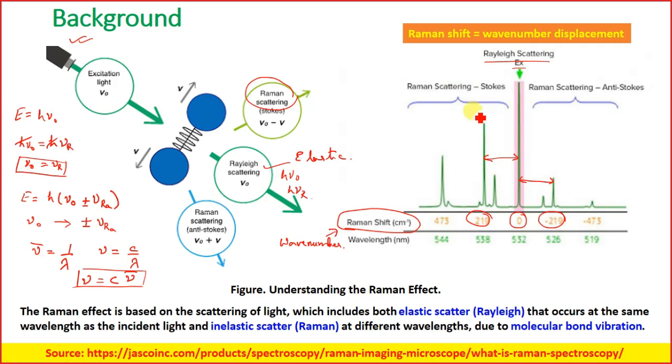So if there is a decrease in the frequency, the lines are regarded as Raman lines or Stokes lines, and these are due to the Raman scattering. Also, if the frequency shift is towards a higher frequency range, that means mu 0 plus this mu ra, which is basically the shift, so if it shifts to the right hand side, then these lines are called anti-Stokes lines.